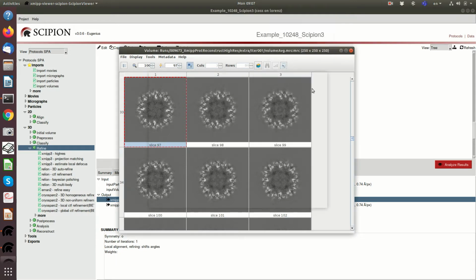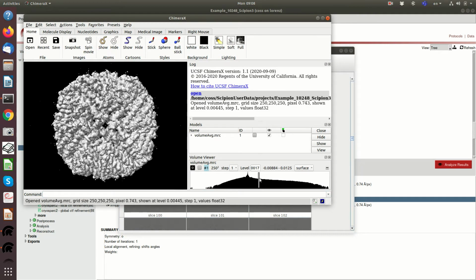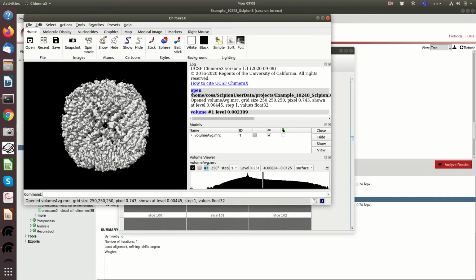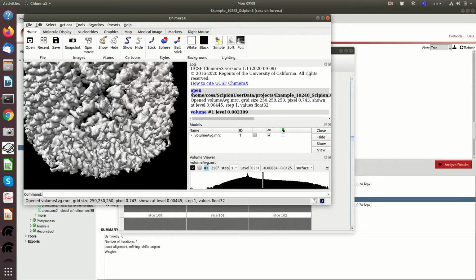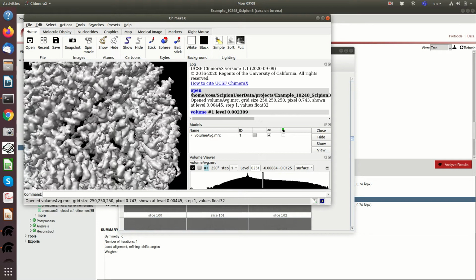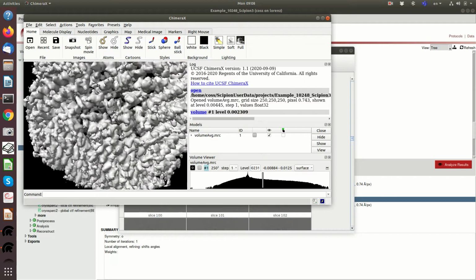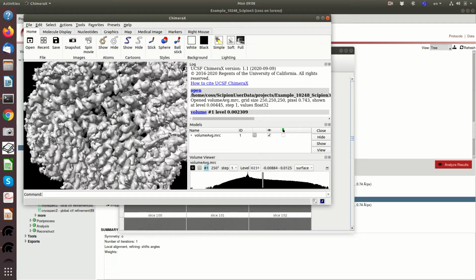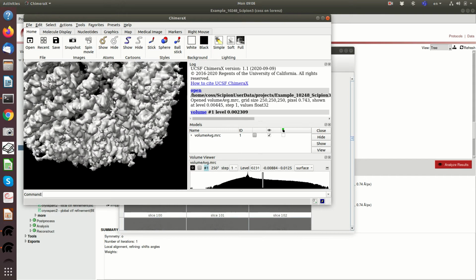And if we look at the 3D structure, we see many more details than we were able to see before, despite the fact that the nominal resolution is still more or less the same. But you see that these alpha helices are much better defined than we had before. But it is not only the merit of high res.